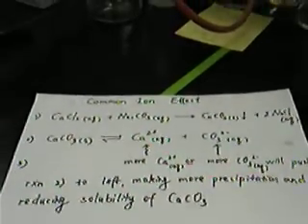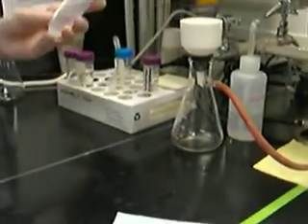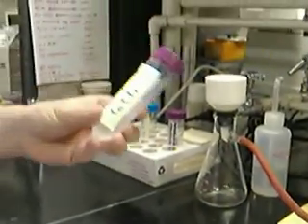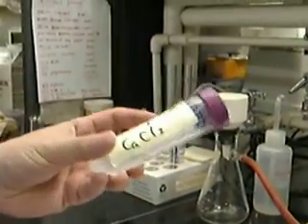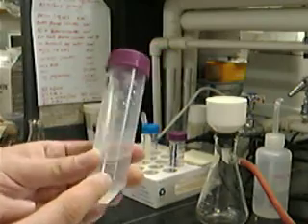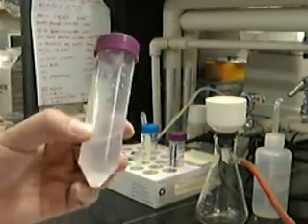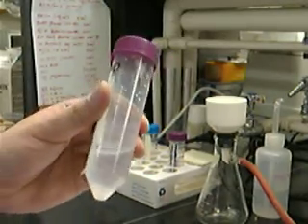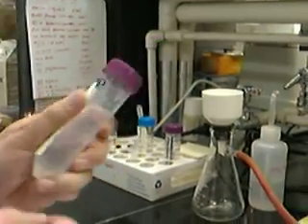First, I prepared this calcium chloride solution. If you look inside this tube, it's pretty clear.